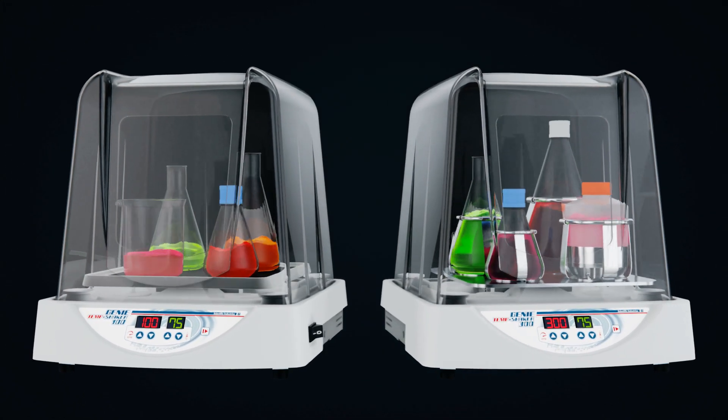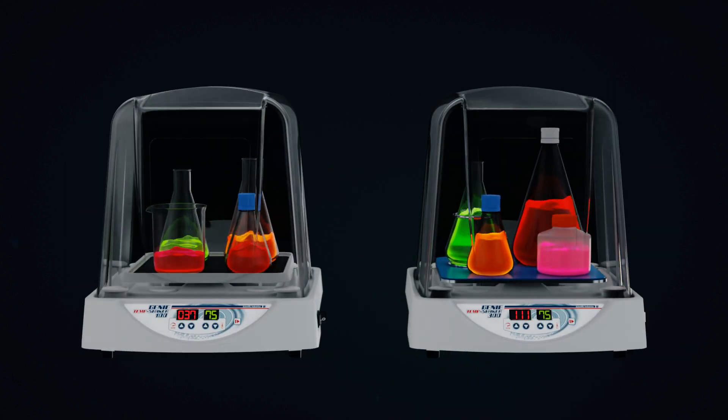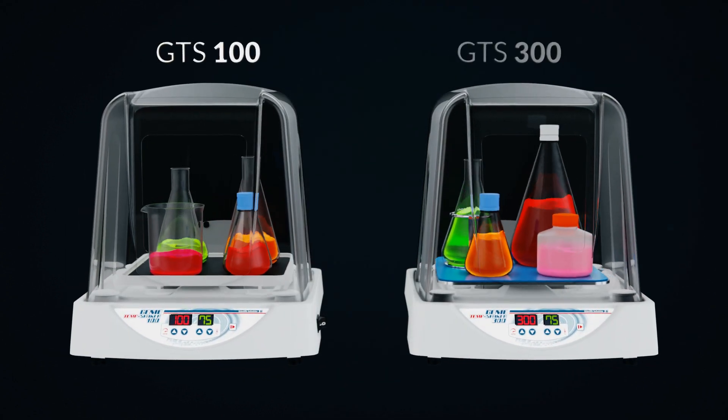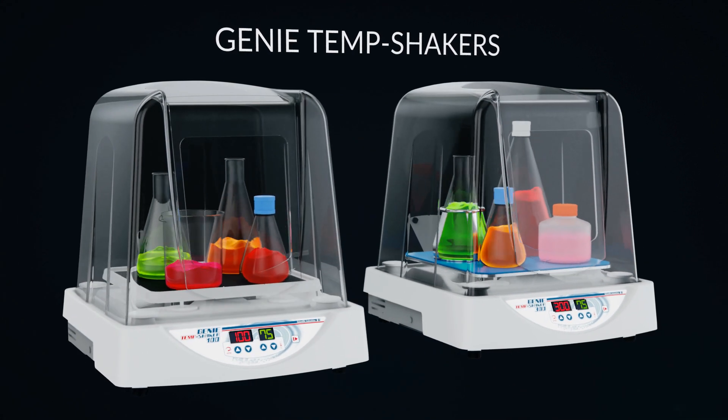This makes these orbital shakers ideal for virtually any laboratory application. The GTS 100 and GTS 300. Built with genie quality in the USA. Backed by a two-year warranty.